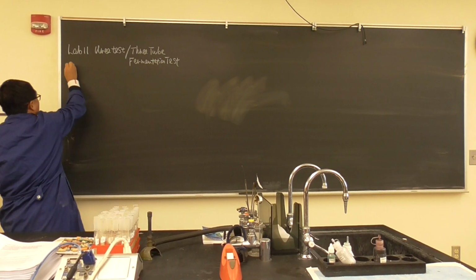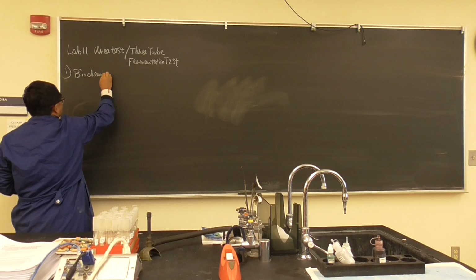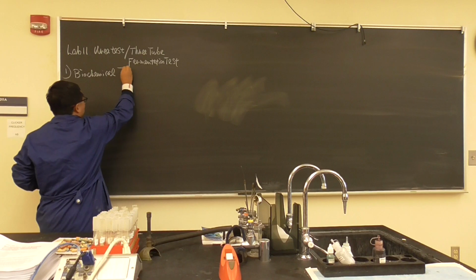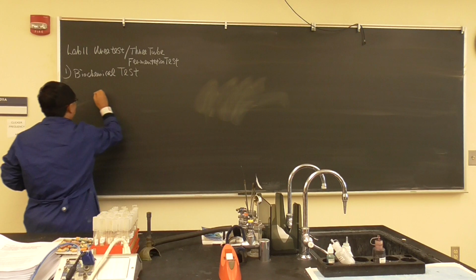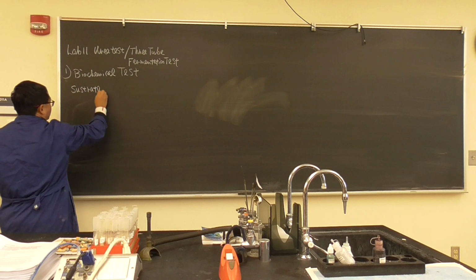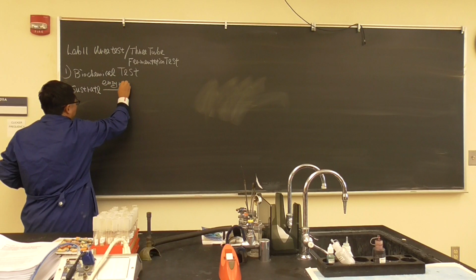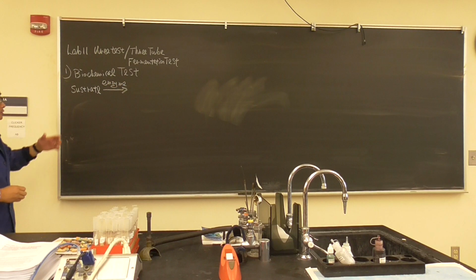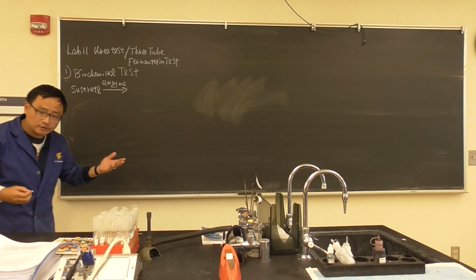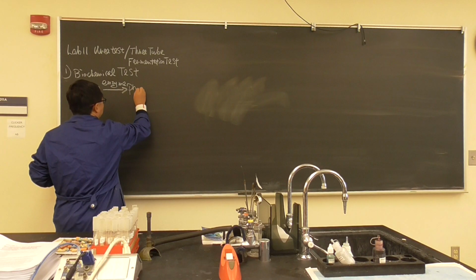First of all, we want to mention the biochemistry test, very simple. Lecture 3 will talk about the details. Basically, we have a substrate, and the bacteria will have an enzyme to react with it and make sure the biochemical reaction can happen in a very efficient way, and then we generate products.